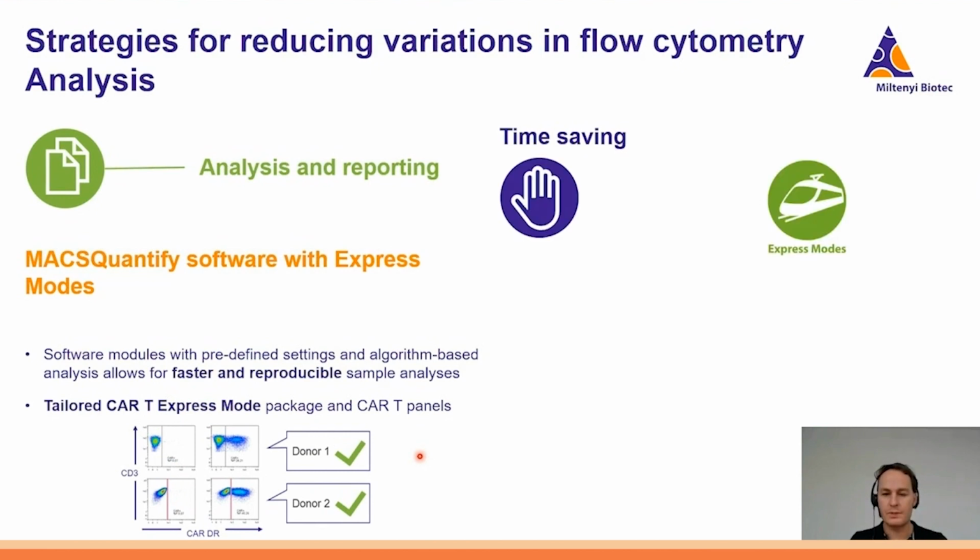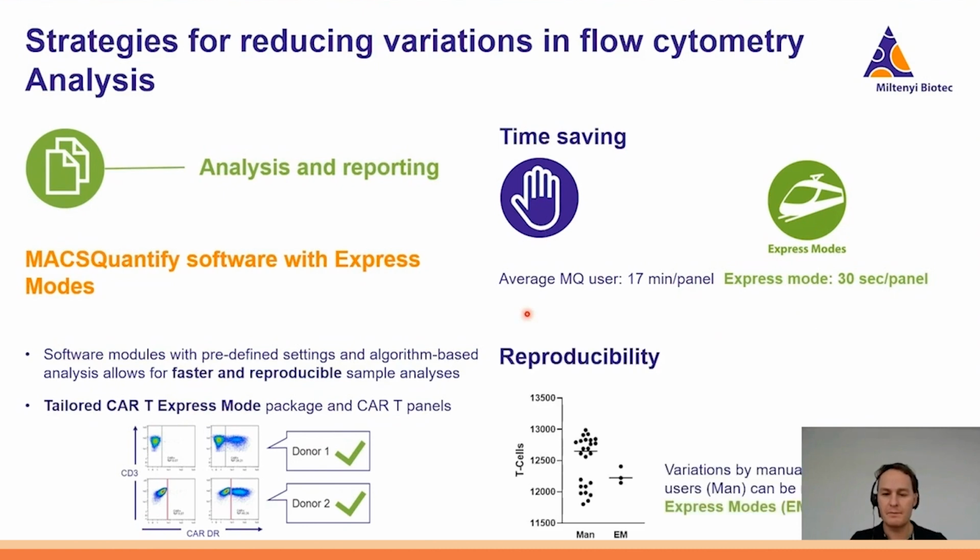That is, of course, very time-saving, because using these automatic gating algorithms is much faster than if you would have to do the analysis by hand. But of course, you also gain a high reproducibility, because the algorithm is obviously always doing it the same, in contrast to a manual user.